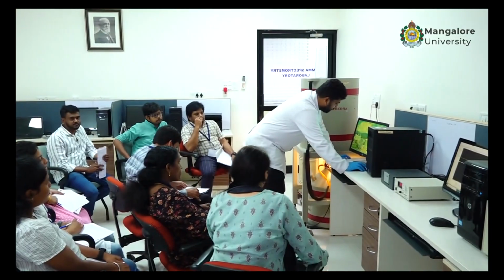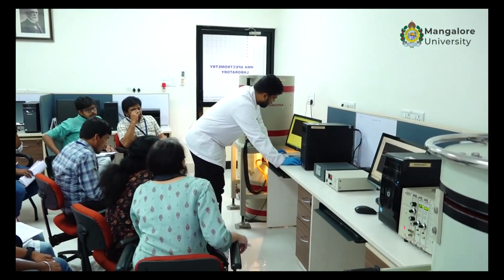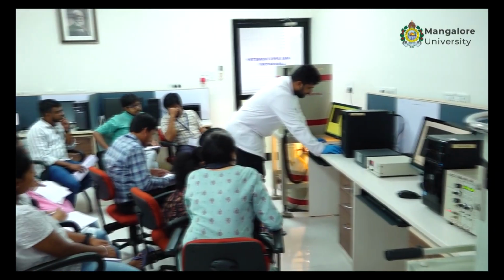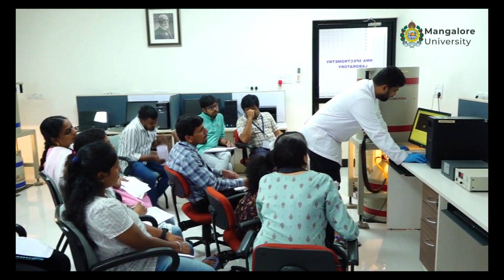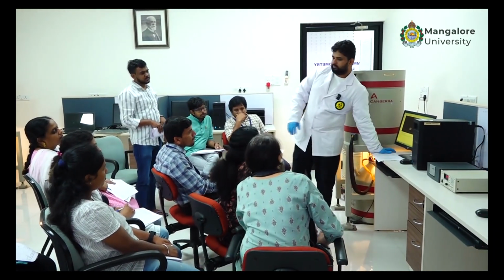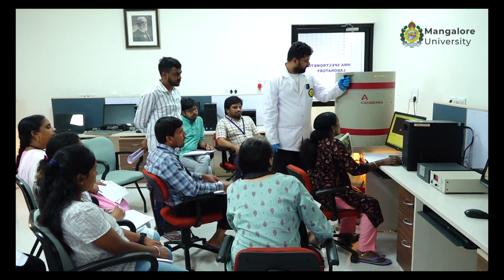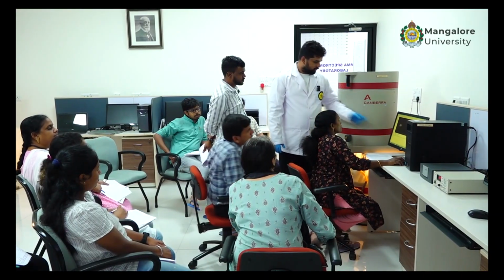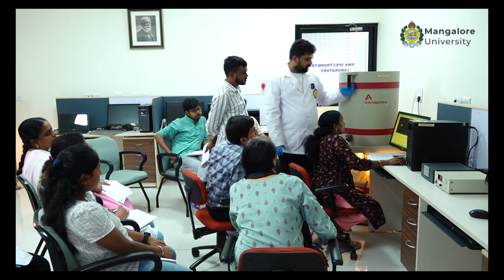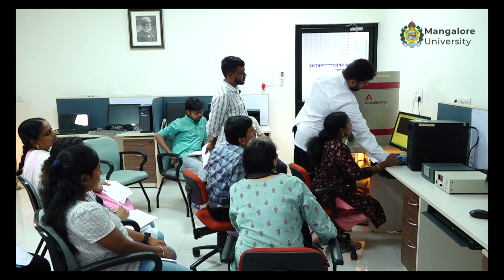So now let me open. You want the chair? No, it's fine. So I'll start counting. Okay. So the same thing you did right now, do you want to do it? Anyone? Yes, sir. So you repeat the same thing. First we want to clear all this. Clear here only. And start. Time set. Start only. 1 minute. Time set is wrong.